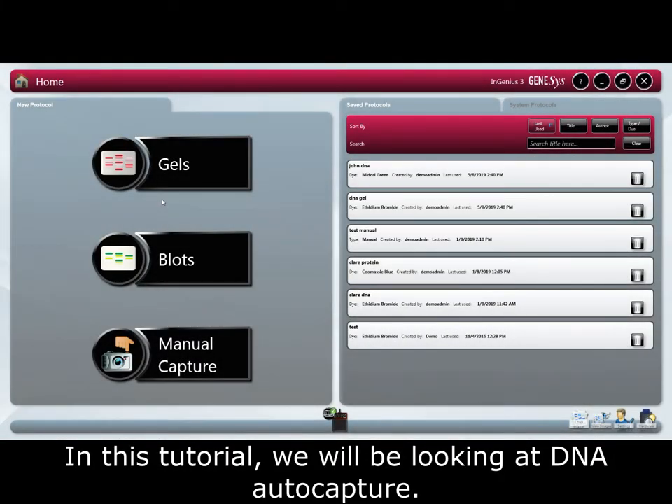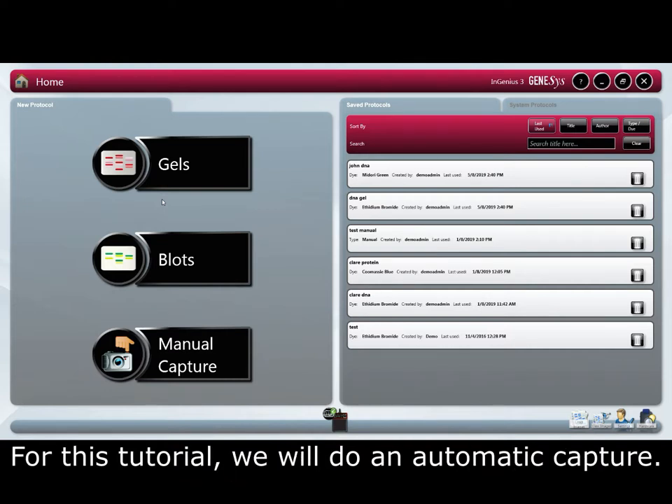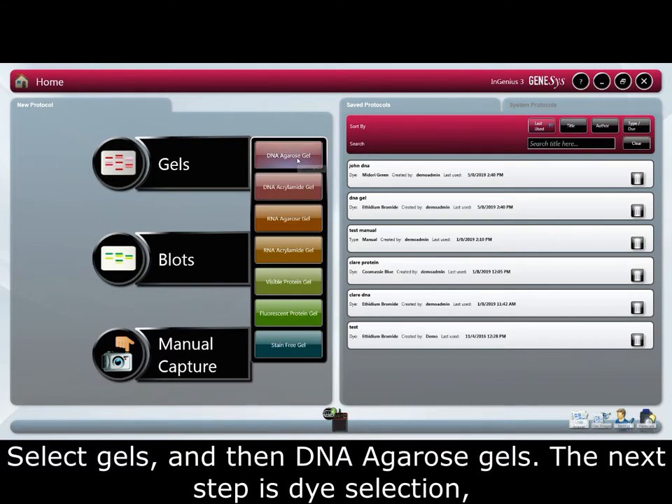In this tutorial we will be looking at DNA auto capture. In Genesys you have two imaging choices: manually or automatically. In this tutorial we will do automatic capture. Select gels, then DNA agarose gel.